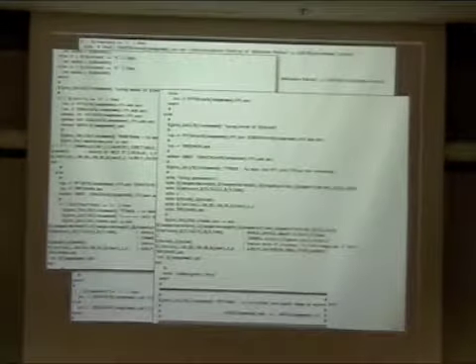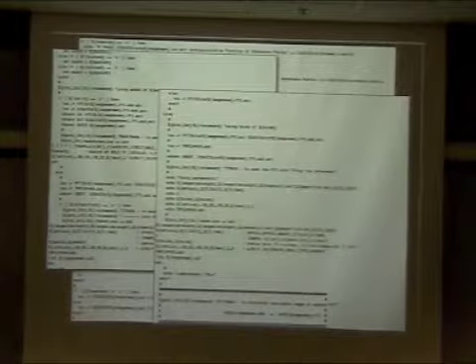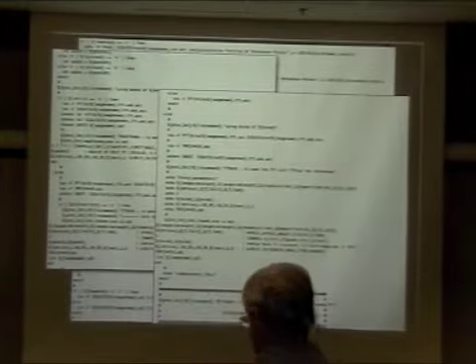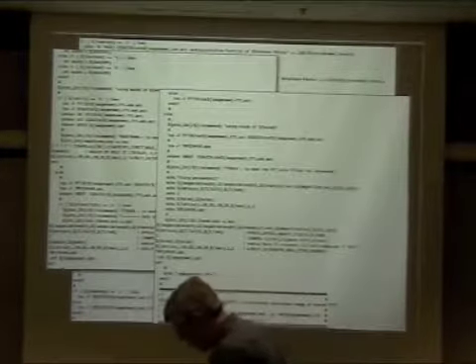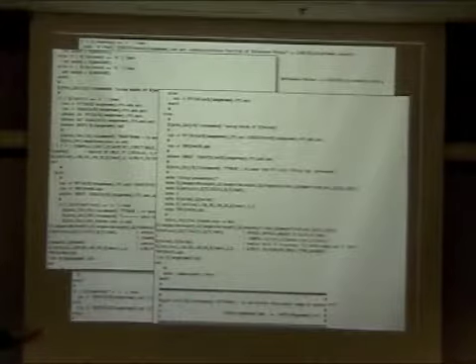Okay, so now the question, the rather important one: how do we do that? Actually, the MRC package is beautiful for it. There's a mountain of publications that sits on top of the MRC suite, and in our opinion, in our processing context, we really don't see any reason to change that too much. What can be quite difficult for grad students is sitting down, even though most labs have some sort of canonical scripting written by someone, it can be daunting for a grad student to, day one, be given a crystallography project and someone says, please read through this and start working.